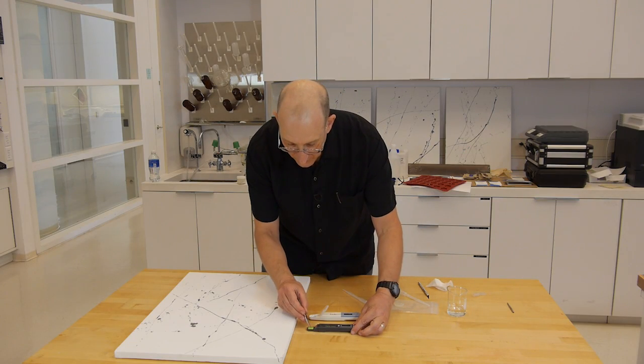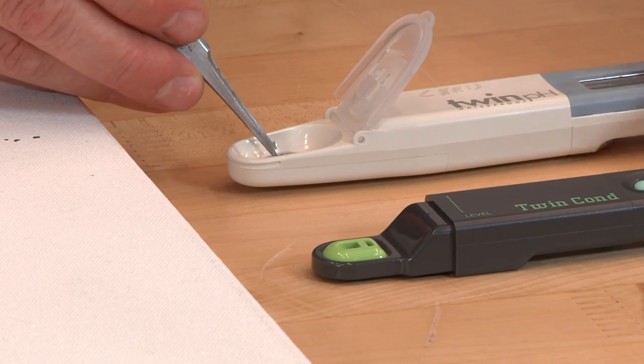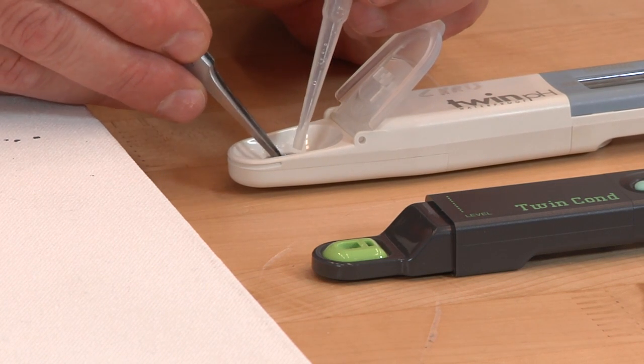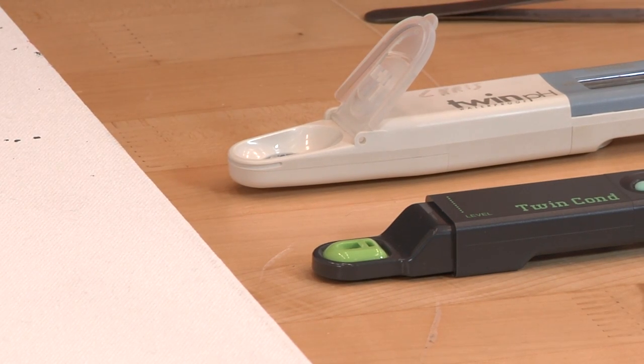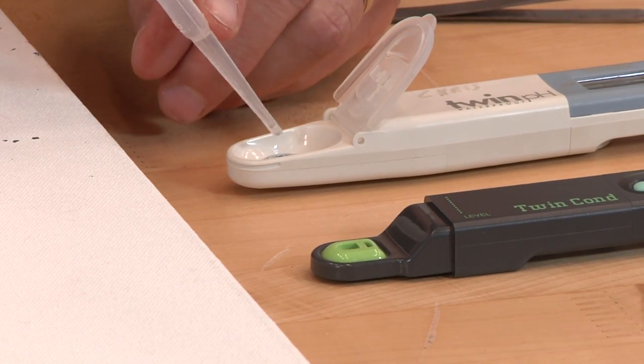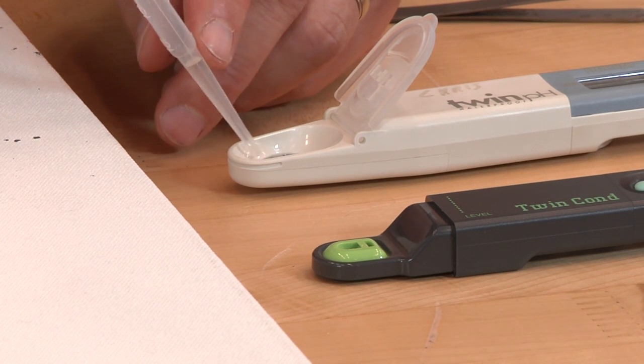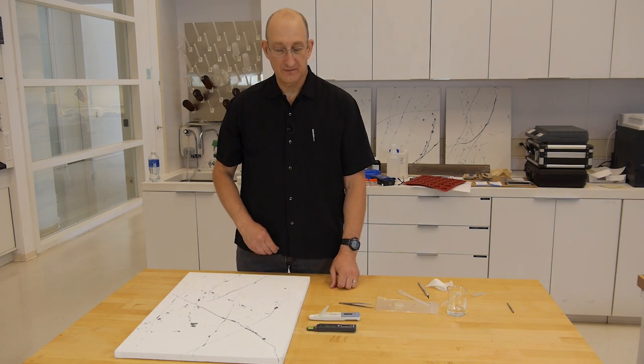After we get our reading, we remove the plug from the conductivity meter and transfer it to the pH meter. And add a drop of distilled or deionized water to bridge between the reference and measuring electrode with the plug in the middle. And we get our pH reading.